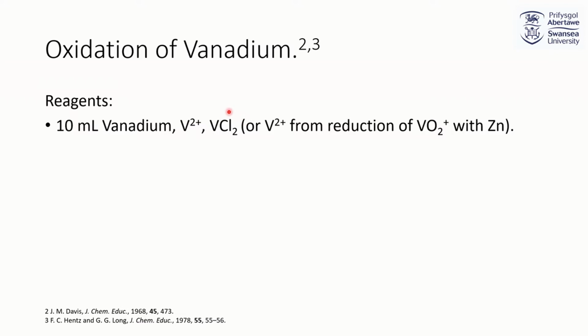Whilst this could be done using some vanadium dichloride, which is corrosive and harmful, it's not the best price-wise, as it's roughly £50 per gram, when vanadium 2+ that is made from the previous reduction could be used, and the hazards should be assumed to be as before: corrosiveness from acidification, toxic long-term health effects, and harmful to aquatic life if not disposed of in the correct way.